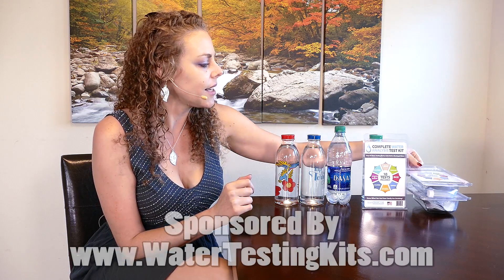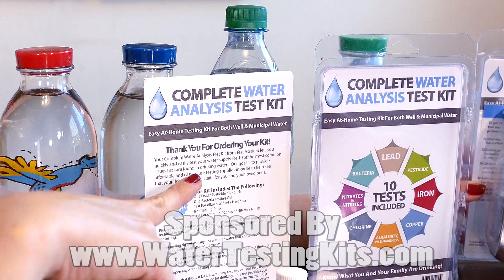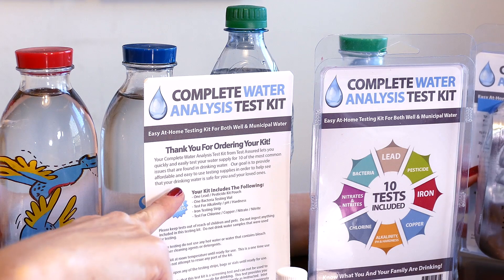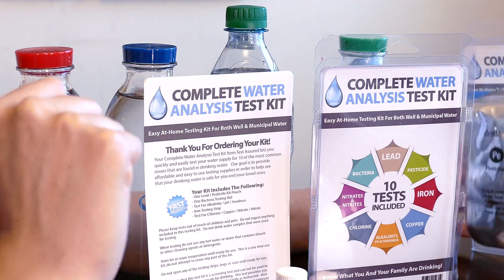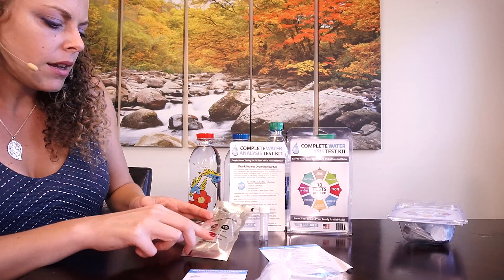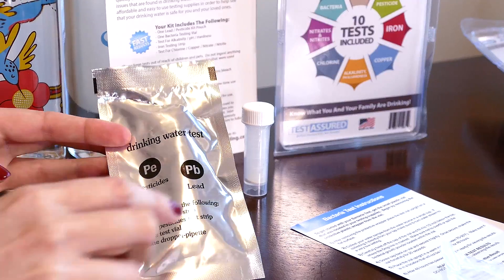Let's take a look at what comes inside of the testing kit. The back of the insert says: 'Here's your testing kit from Test Assured. Our goal is to provide affordable and easy to use testing supplies in order to help people see what is in your drinking water and if it is safe for you and your loved ones.' When we open this up, we have a lead test strip, a pesticide test strip, a test vial, and a dropper pipette.